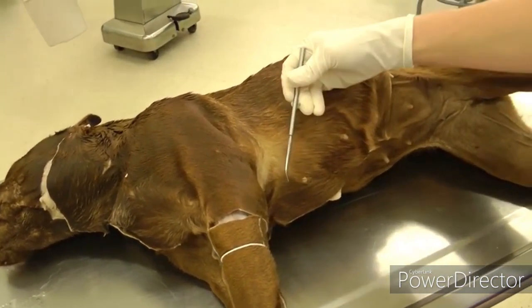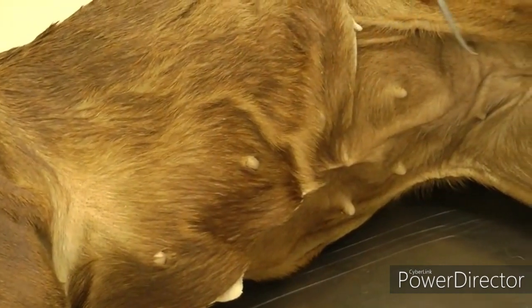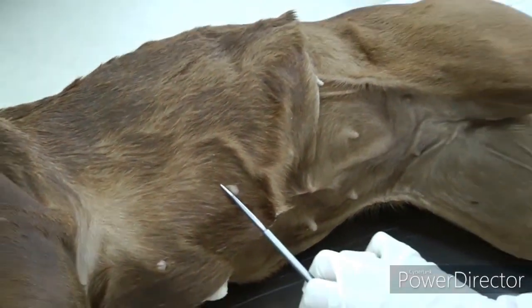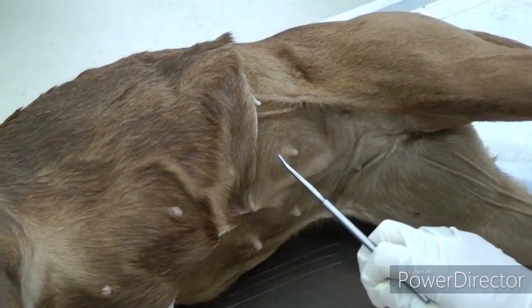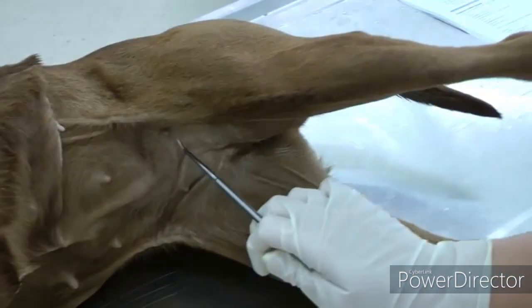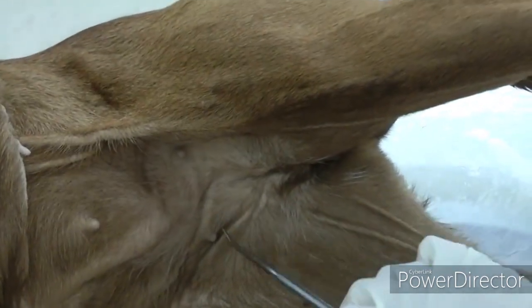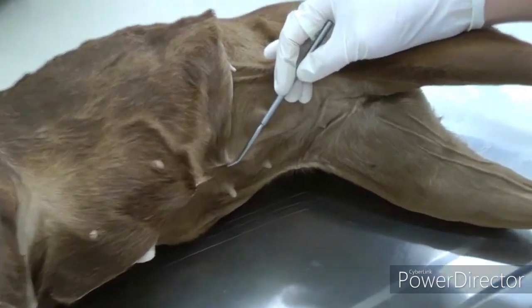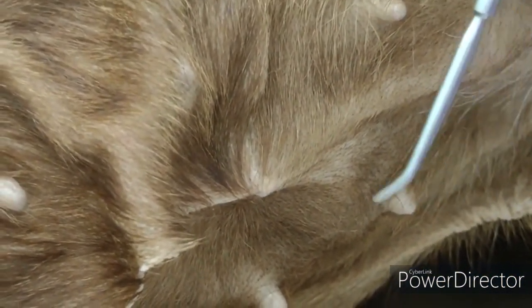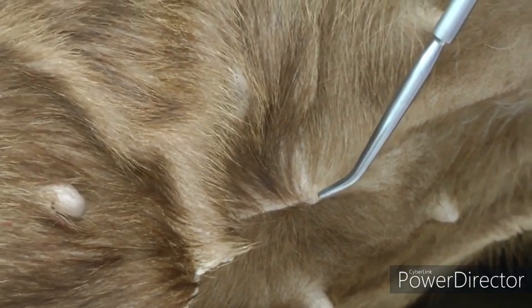To begin with, you're going to look at the mammae. Here you have five pairs of mammae: a cranial and caudal thoracic set, cranial and caudal abdominal mammae, and then the inguinal pair. You also want to try and find the umbilicus, which on this dog is nice and clear. From there you're going to make your skin incisions.